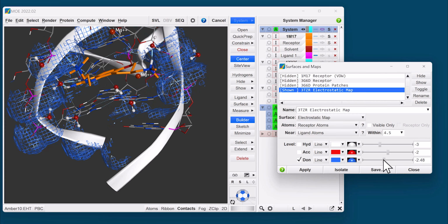different energy levels in kilocalories per mole. In this case, we find the ligand is anchored by these donor interactions, but there are potential opportunities to improve the design of our ligand to take advantage of one of the acceptor interactions that we saw.